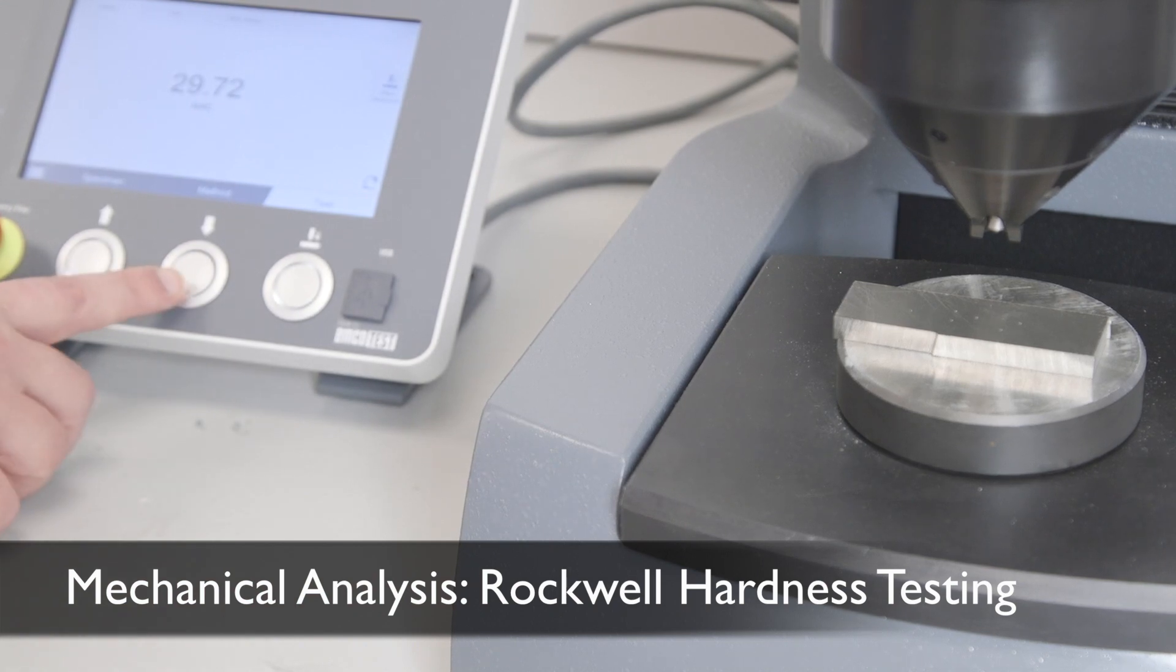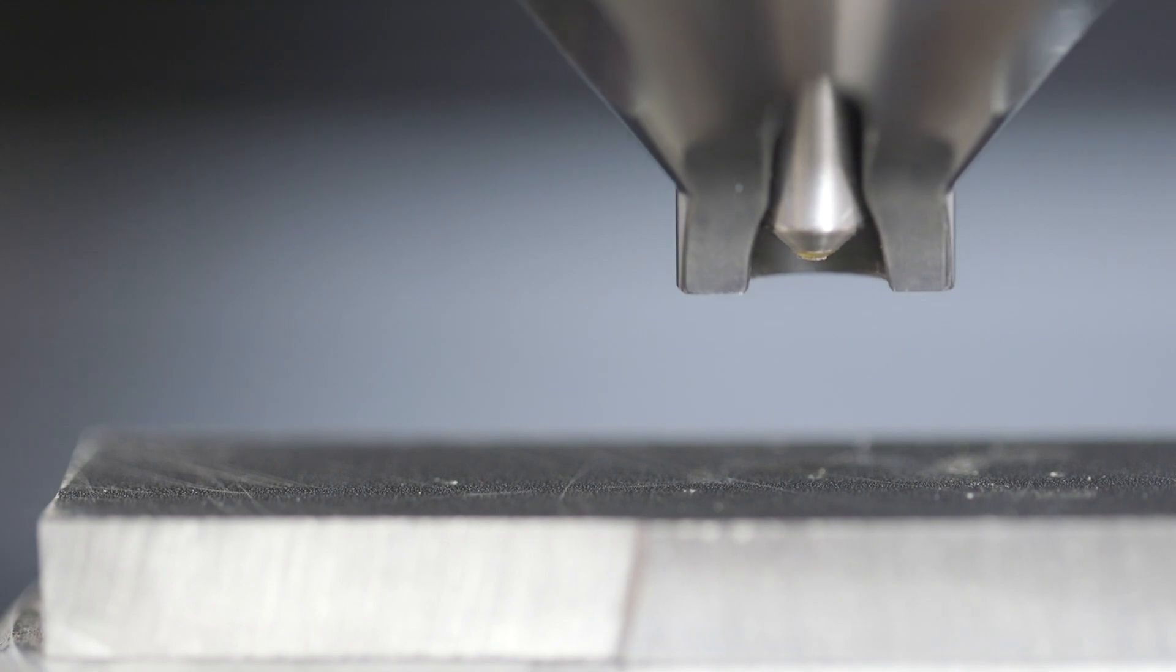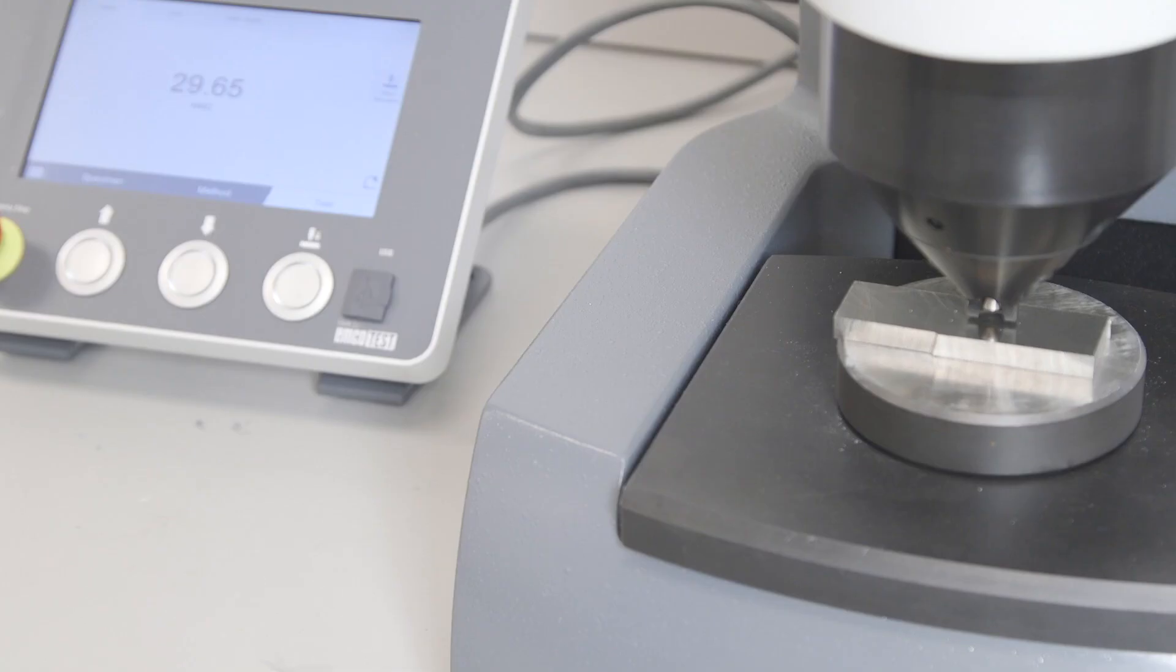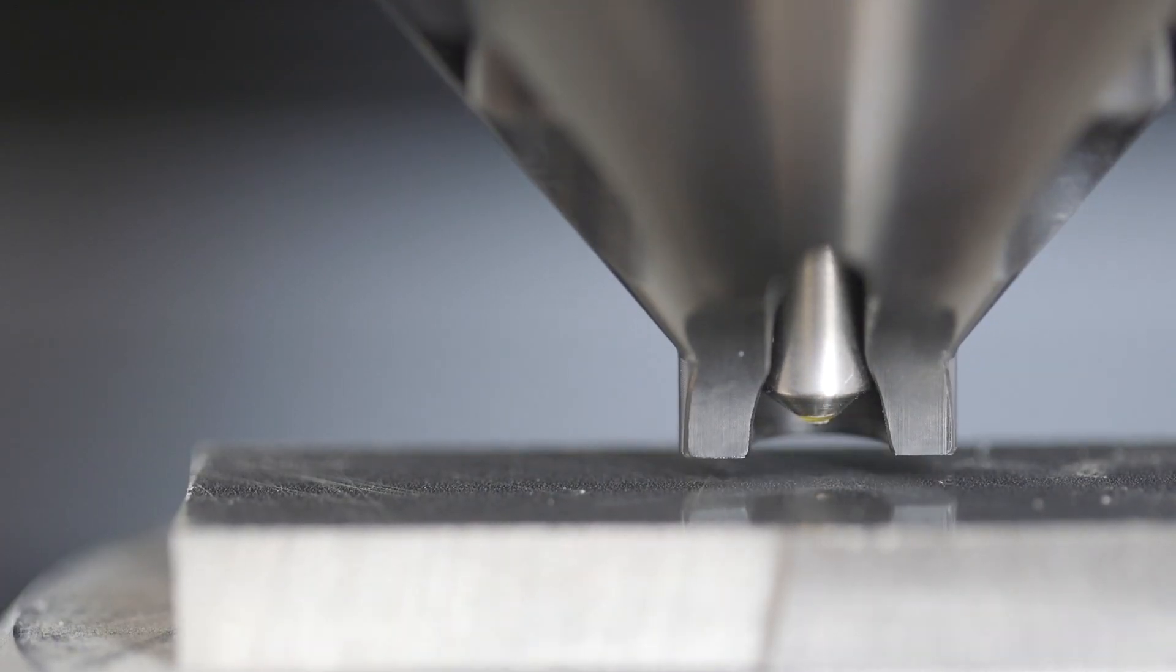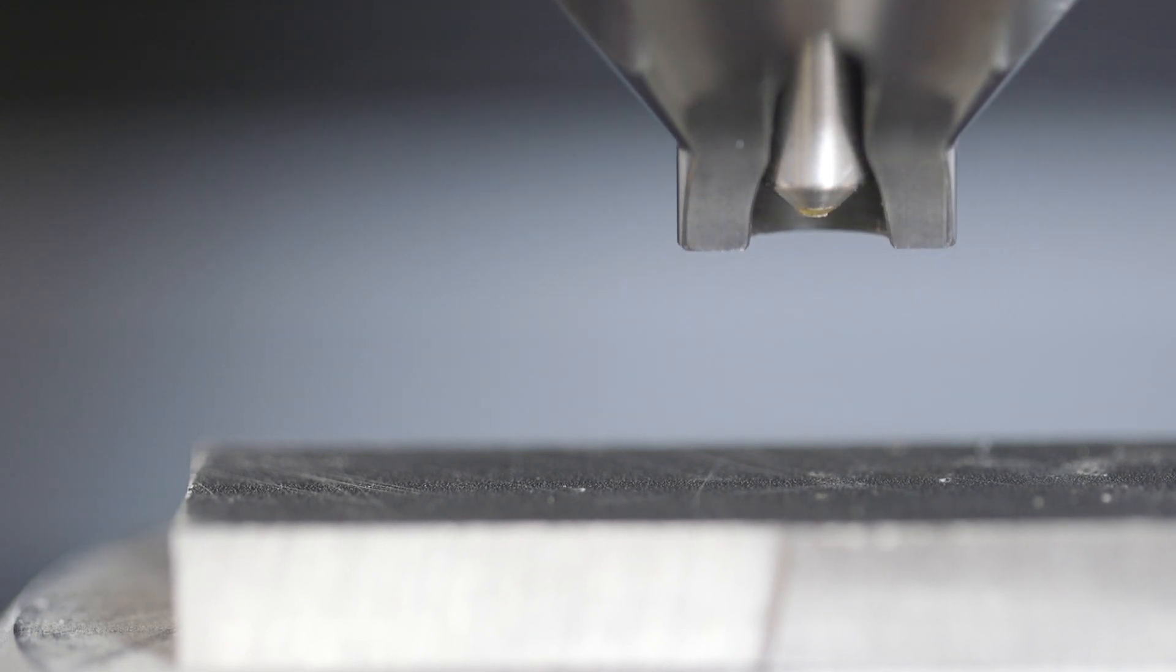Here we are performing the Rockwell hardness testing. It is a macro test to quantify the relative hardness of materials. It uses a diamond tip with a certain load and measures the indentation depth into the materials to distinguish the hardness of the materials.